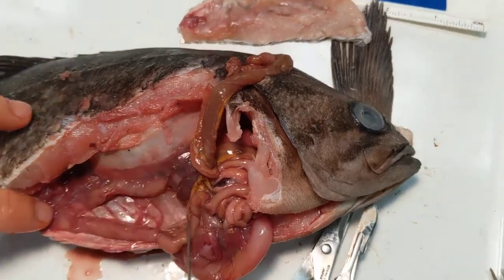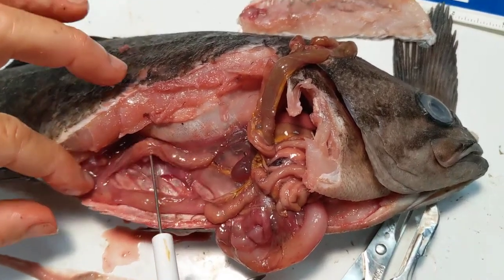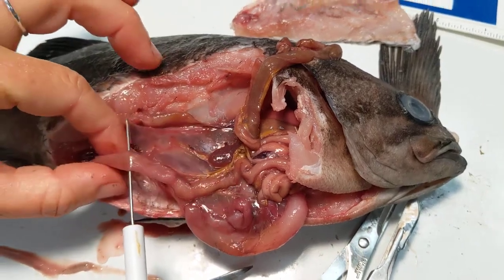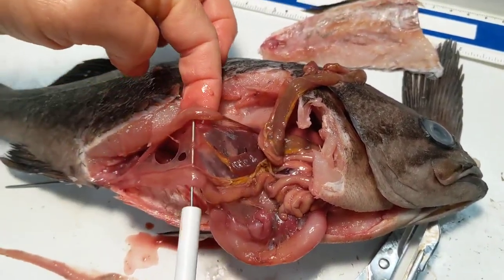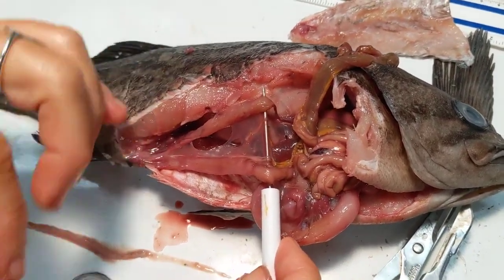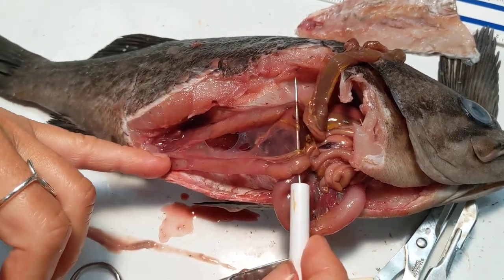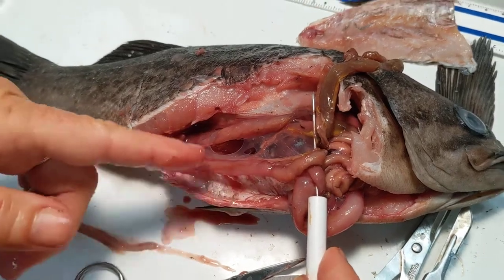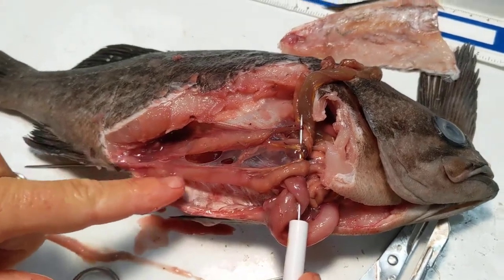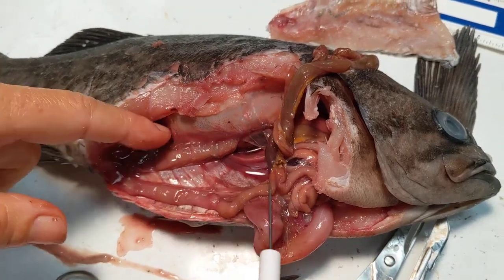Now what we can see are laying out here two lobes — these are the gonads. A way to tell a male and a female fish is that usually the males, the testes, will be white and narrow. And the females tend to be more pink and rounded. So this is a female. She is not gravid, but she's getting there — she's mature. I can see that by the fullness of her gonads, but they could be quite large when she's ready to start breeding. You'll see the eggs within there.